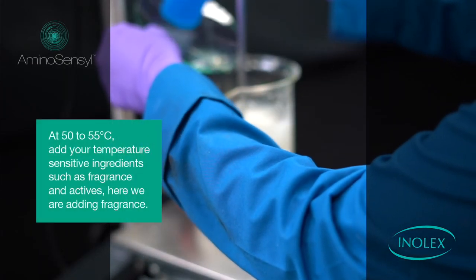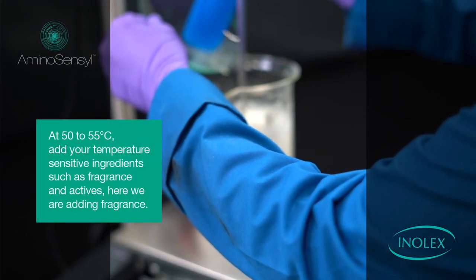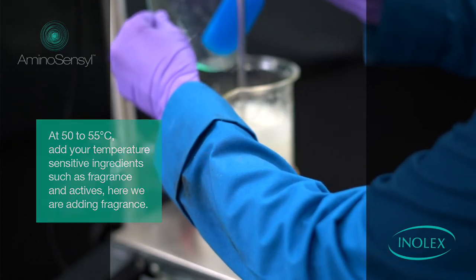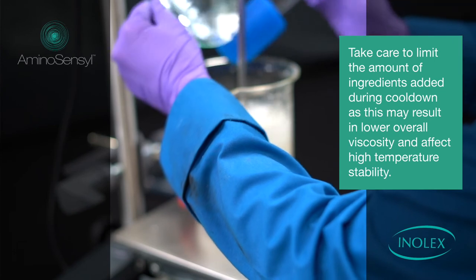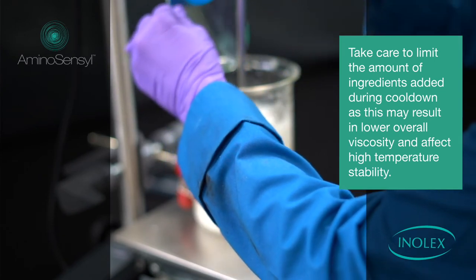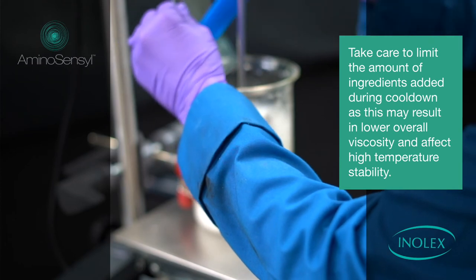At 50 to 55 degrees C, add your temperature-sensitive ingredients such as fragrance and actives. Here, we are adding fragrance. Take care to limit the amount of ingredients added during cool-down, as this may result in a lower overall viscosity and affect high-temperature stability.